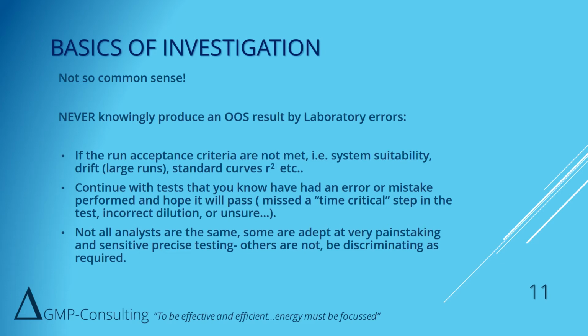There are quite a few biological assays which are time consuming. For example, the endotoxin test, and there's a kinetic step in there where you have to use a heating block for a certain number of minutes. It's quite easy for an analyst to make a mistake there and cook it for too long, and you end up with an invalid assay, and it causes a lot of waste of time. It's not actually an out of spec, but the main point is don't proceed with assays and testing or production if you know it's not going to work out in the first place.